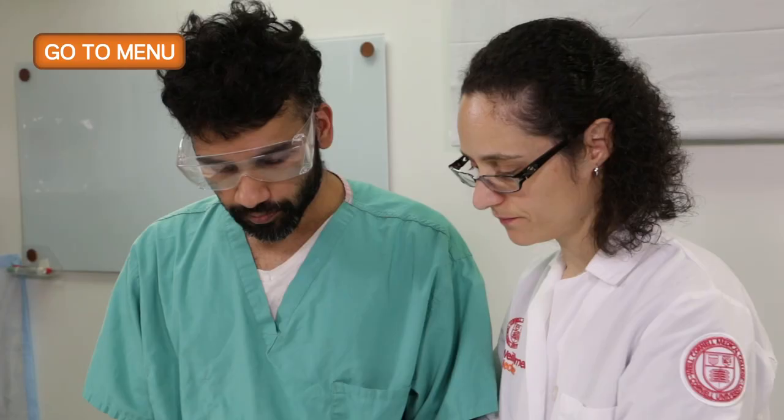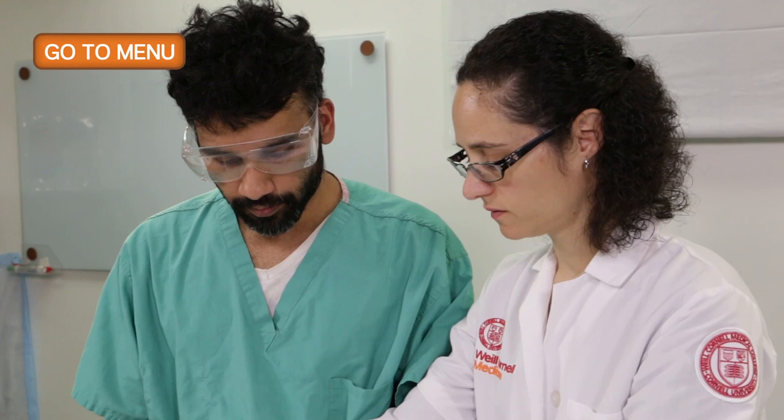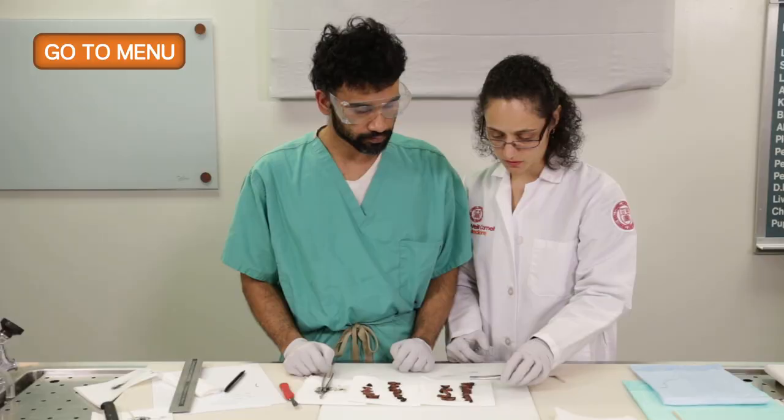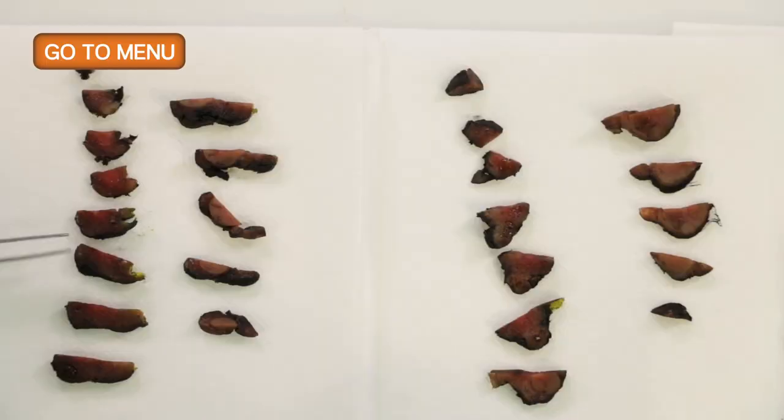And do you comment on how close the lesion is to this particular margin, to the ink capsule, after you section through the whole thing? Right. So you comment on whether you think it's invasive or not, and its distance to the capsule and the distance to the isthmus margin. Okay, which it does not seem to be grossly involving anyway.